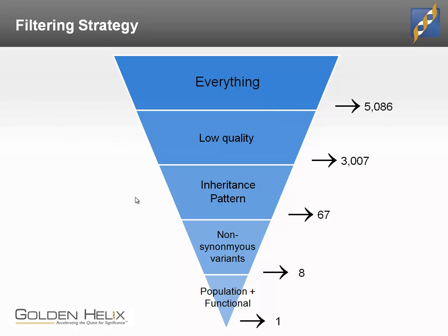and go about this as if it was our first look at the data. Now, it's again important to note, just like when Gholson did his research, he went about it and found that he could get to the same result using 5 different approaches. We advocate the same thing. Although we're using this specific set of steps for filtering, we could reach the same set of conclusions using a different population filtering technique than we're going to use, by changing the order of things here.